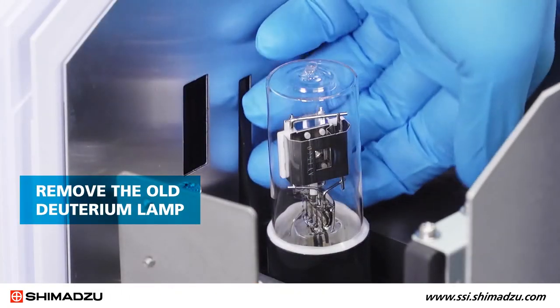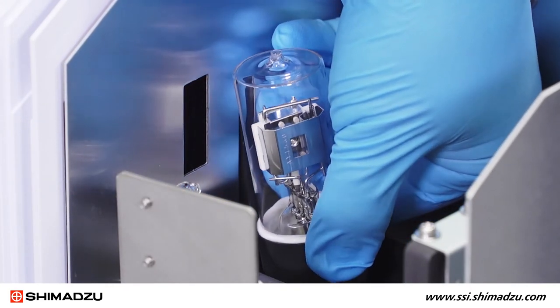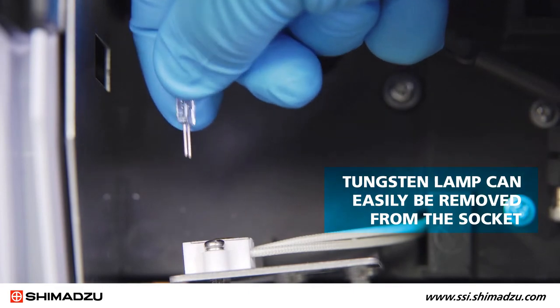Remove the old deuterium lamp by gripping the base and gently rocking it back and forth until it is freed from the lamp compartment. Now the tungsten lamp can easily be removed from the socket.